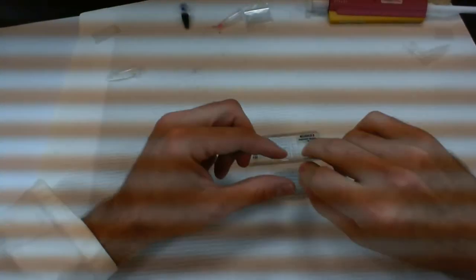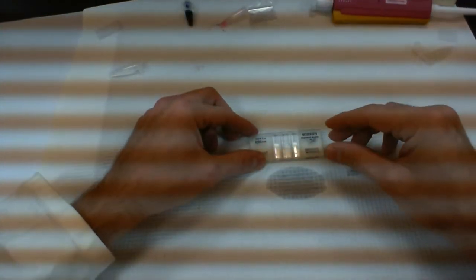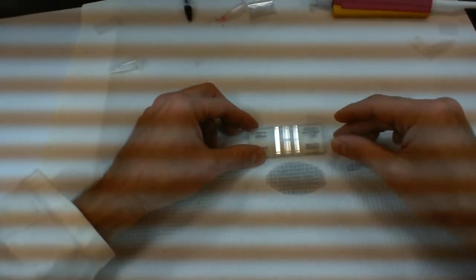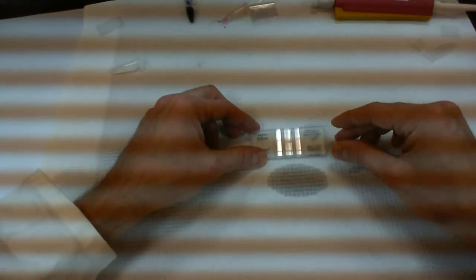And what you're going to do is then put a cover slip on it. Now, I've had many students tell me in the past that they've tried this before, and they put the cover slips on, and these are supposed to be filled by capillary action, but capillary action doesn't work. Capillary action does work. The problem is that they weren't putting those cover slips on properly. So there's a trick to this.